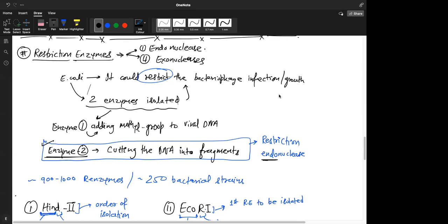It just binds to the DNA. So the point is, there is a rope. You have to hold on to a rope, okay? But if I just bind a lot of big balls everywhere on the rope, you won't be able to hold on to the rope, correct? Yes. So that's DNA. The rope is DNA. The rope should be accessible so that something can hold on to it.